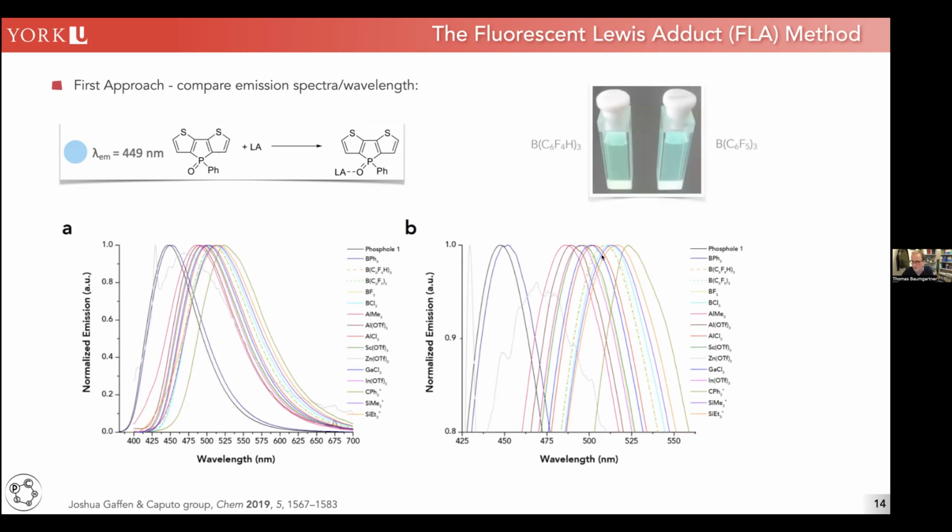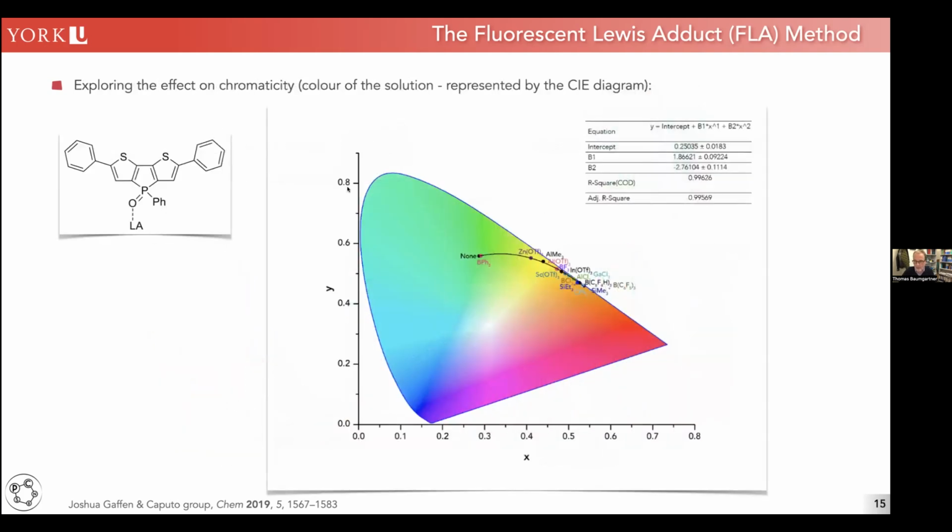But we did notice that when you look at the color of the solution, so here we have the para-hydro species and here's BCF, you can see there's different shades of green that we noticed. And we said, that's interesting. And then we realized, yeah, these different shades of green actually take into consideration the entire emission spectrum, not just the emission wavelength. And you can actually measure this. This is called chromaticity. This is something that's well known in the lighting industry, actually. For those of you who have never seen this, this is shown here.